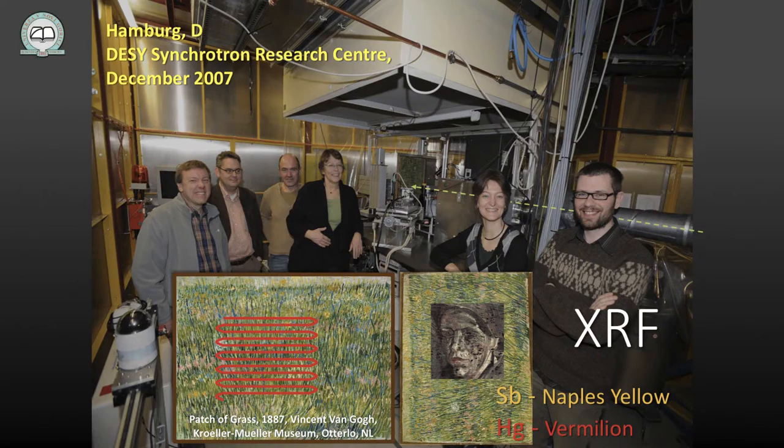Anyhow, we were there and we managed to do an experiment by shooting with an X-ray beam, which is not so big, and then moving this painting through and then seeing what would happen. Now, I draw it here, but people should not be in the same room where this very intense X-ray beam is, but okay, that's not really important. What surprised us is that when we're doing this serpentine movement and collecting information from many positions on the painting, we could obtain an image which looked completely different than what you could see with your own eyes on the surface.